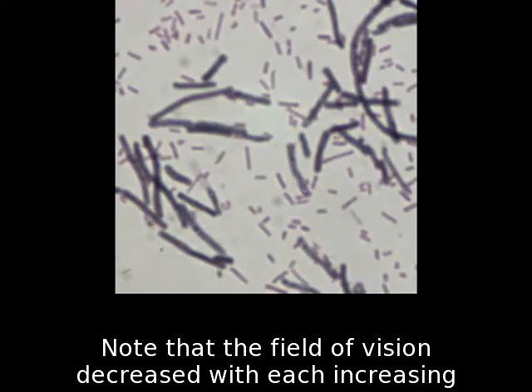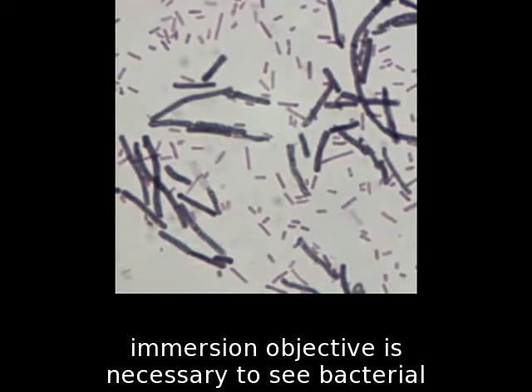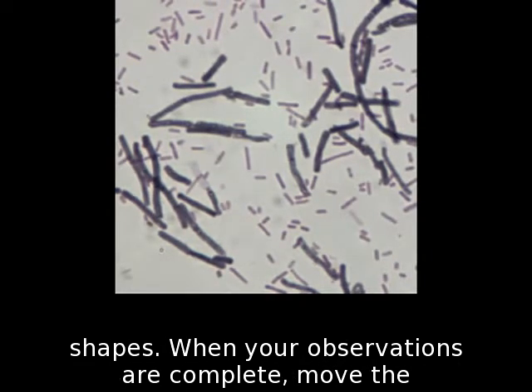Note that the field of vision decreased with each increasing magnification. Note the shape and size of the cells. The oil immersion objective is necessary to see bacterial shapes.